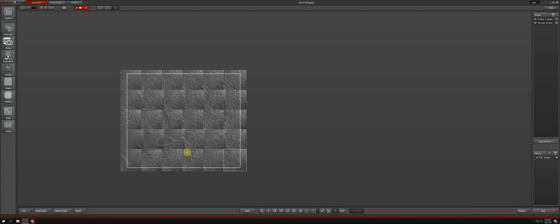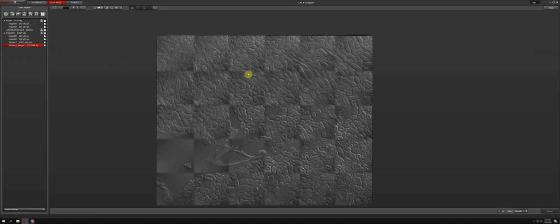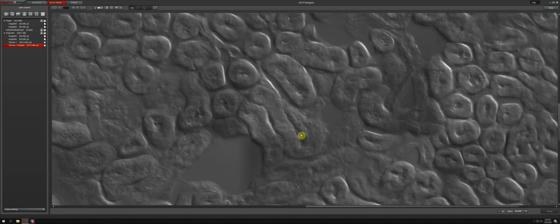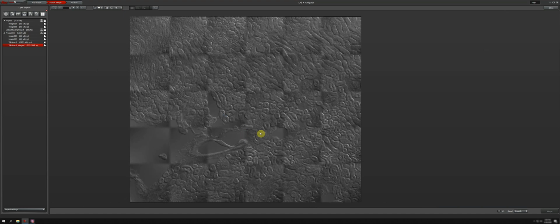After the images have been acquired, they are now being stitched together, and then we can view the stitched end results in this viewer here, clicking here. So as you can see, the images are actually very nicely stitched together, but still we're getting a lot of shading in this sample.